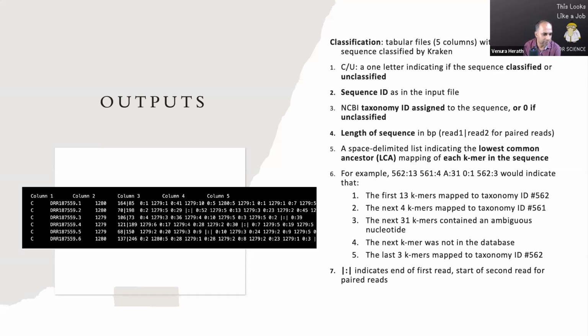And Randika, you got different data. What is the database you used? What is the pre-built database you used? Was it the PF18 or a different one? Can you share a screenshot in the chat window?